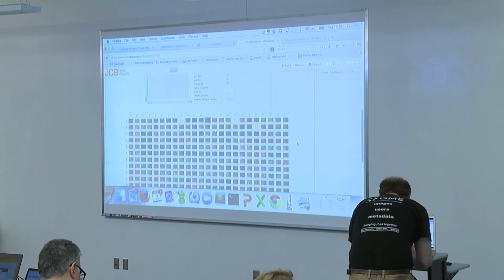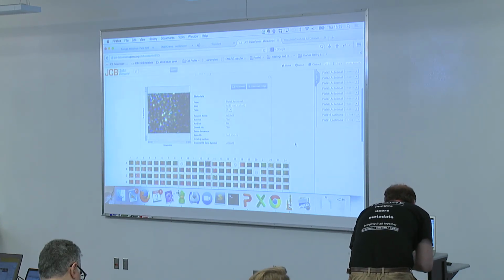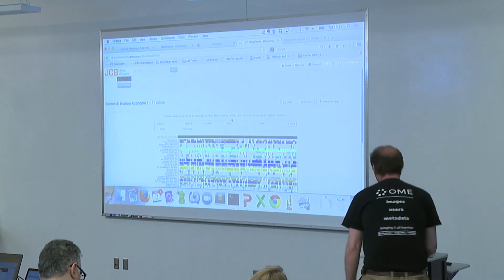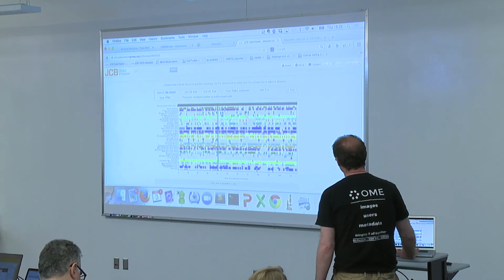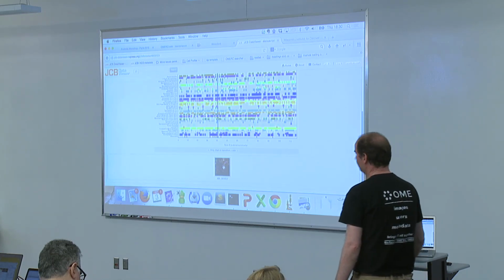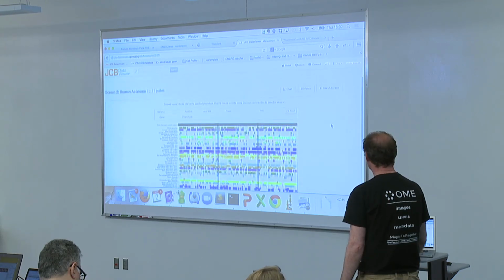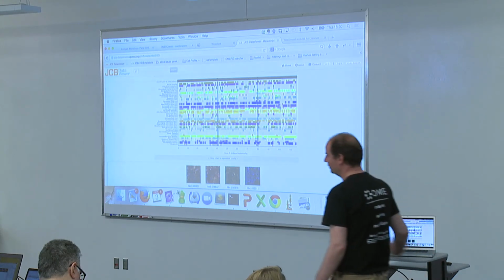So this is the full viewer. That will be the chart, okay? These are probably the genes which were identified using that screen. If I now select something here, this is the thumbnail of the image from which this information was taken. If I select something else, a new thumbnail will come up. This is probably not the fastest internet you can imagine, but it does its job.